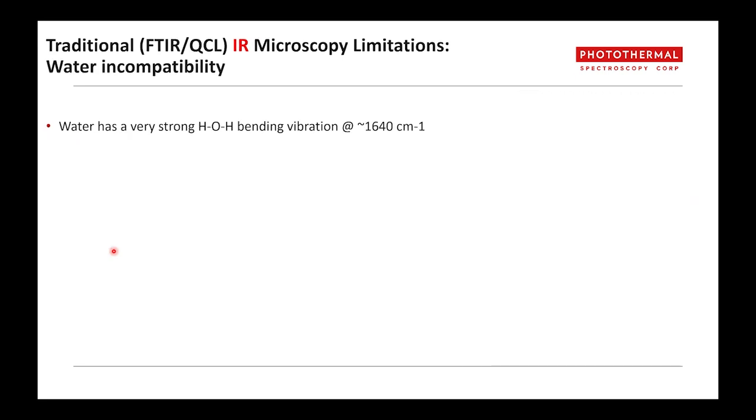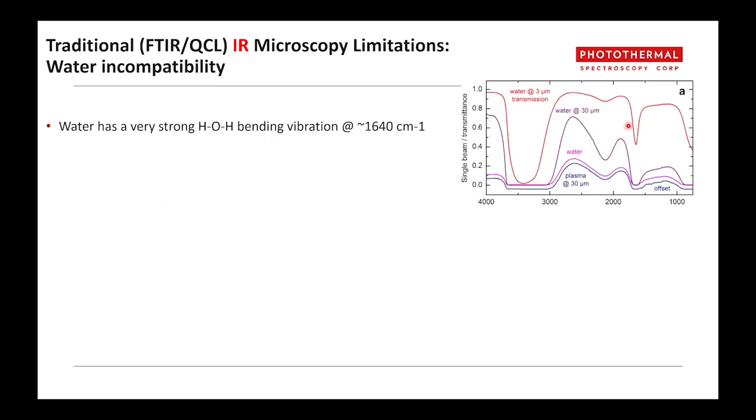Another key life science relevant consideration and challenge with traditional IR is water compatibility. Unfortunately, water has a very, very strong OH bending vibration at 1640. So that's that band there. There's a dip in the transmission of water in the infrared.